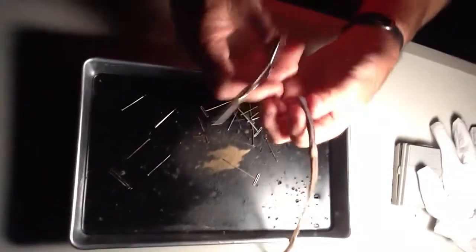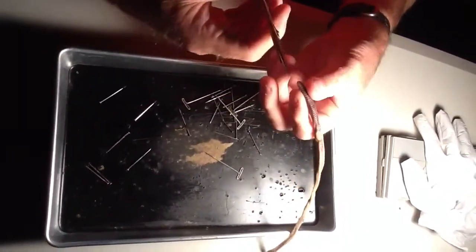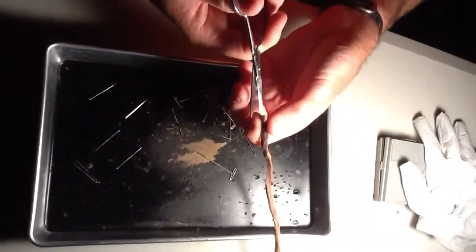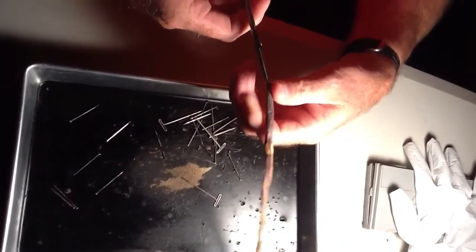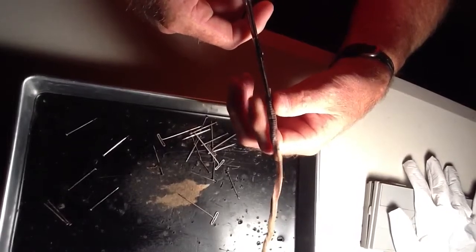They're counter shaded. And I'm going to stick the scissors. I'm going to try to find the sharpest end of the scissors. And all the scissors seem to have a sharp end and kind of a duller end. And I'm just going to take the scissors and stick them into the mouth and go right, trying to keep the point real close to the skin, right along.